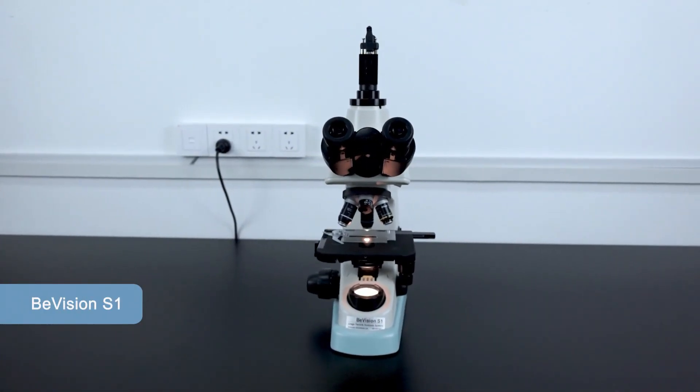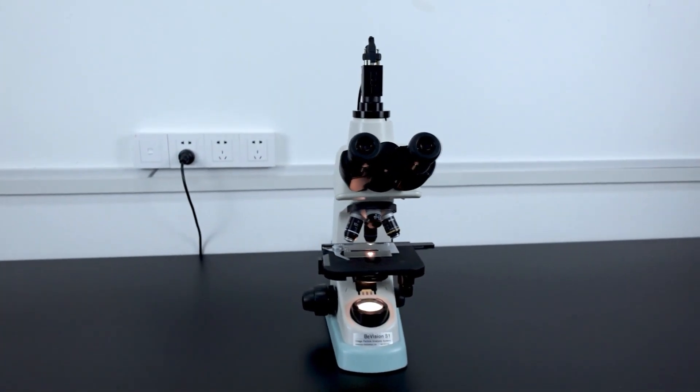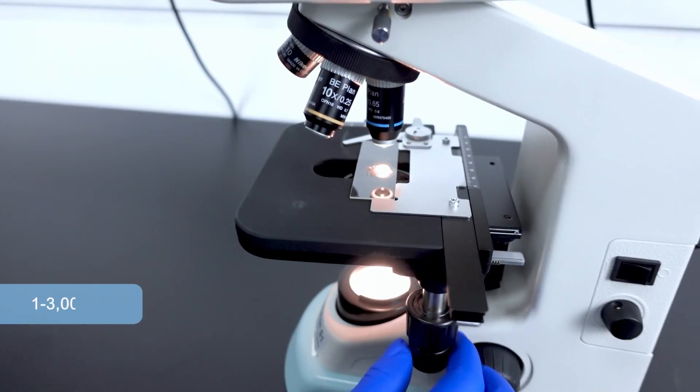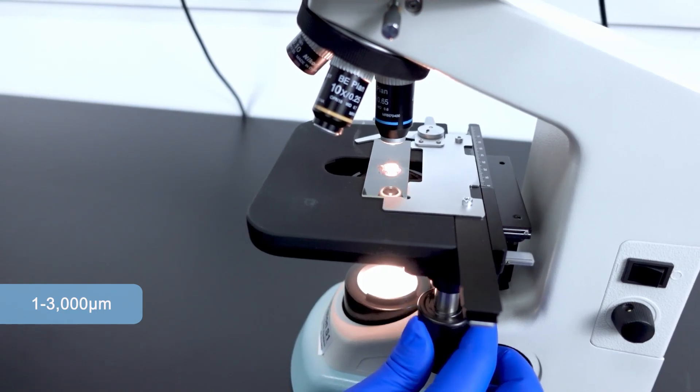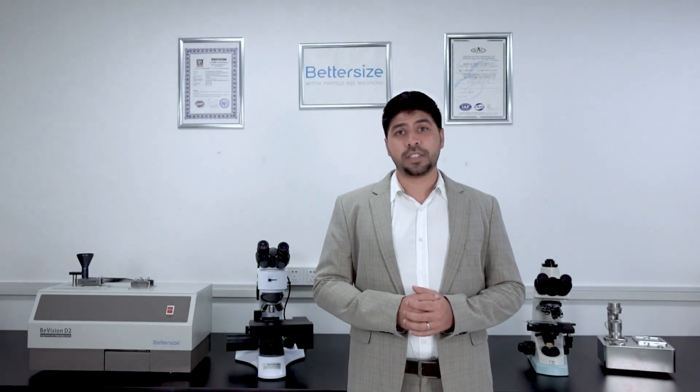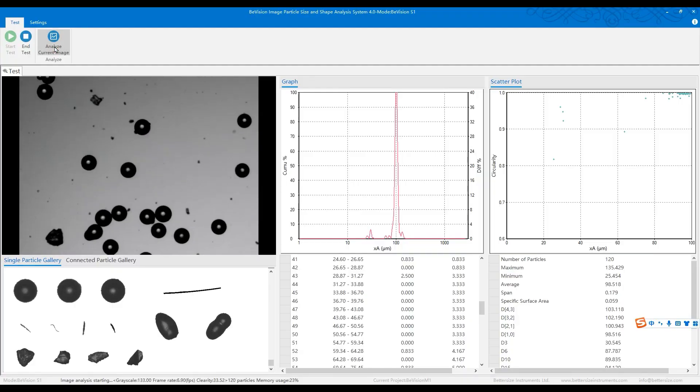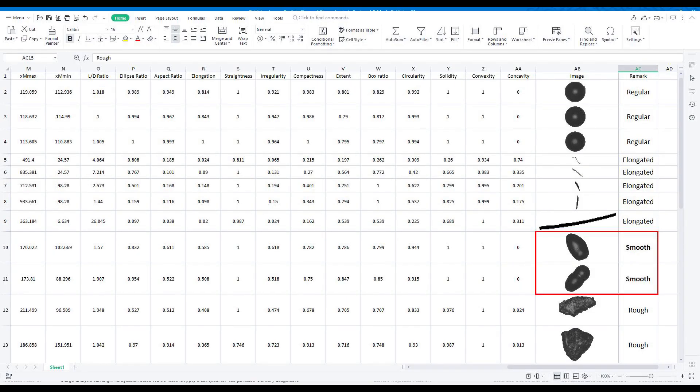The BeVision S1 is a static image analyzer providing high-resolution direct measurement for powder and suspensions in the size range from 1 to 3,000 microns. It allows you to confirm the presence of agglomerates in your sample suspensions to determine if your particles are regular, elongated, smooth, or rough.